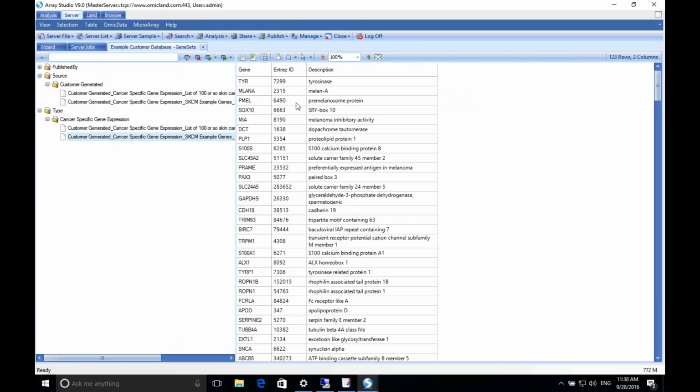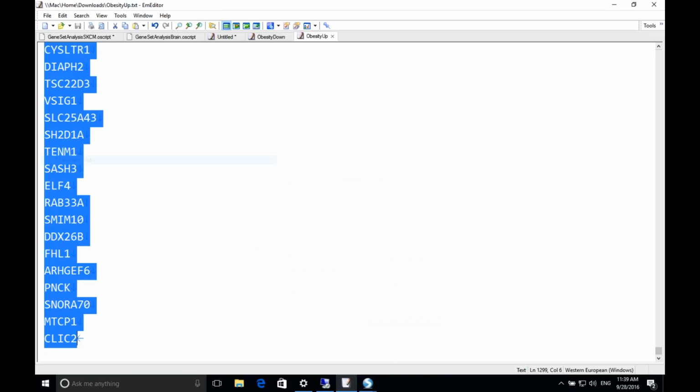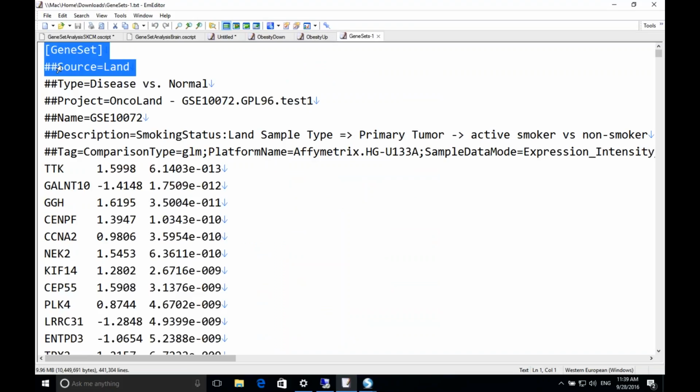In some cases, it has the fold changes and p-values, but only if you actually put it in there. And you can add in your own gene sets in this tab as well, either using the wizard, or if, let's say, you had your own set of 1,000 pre-calculated gene sets, there's a pretty simple format for it, and you can mass import these as well.